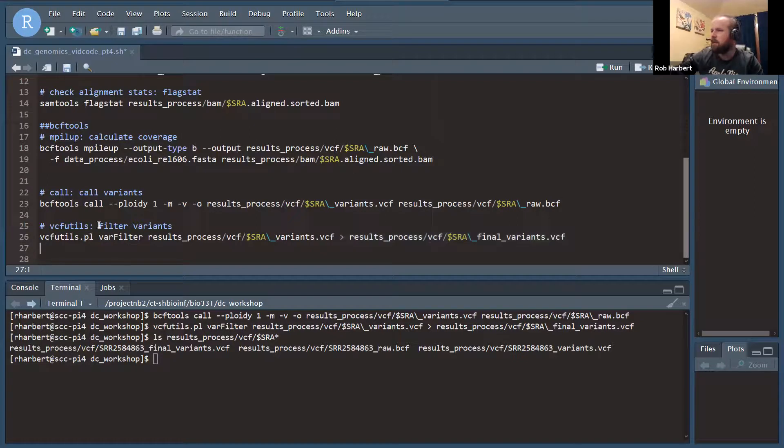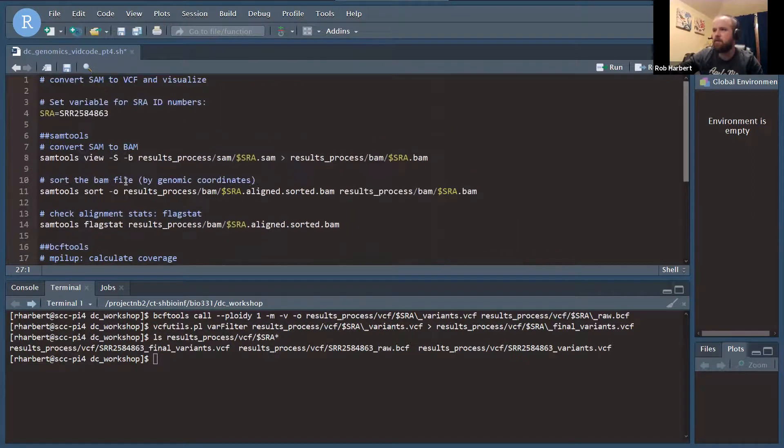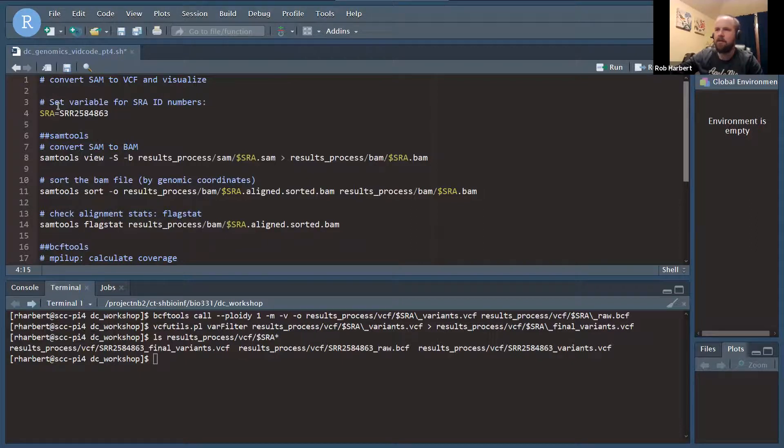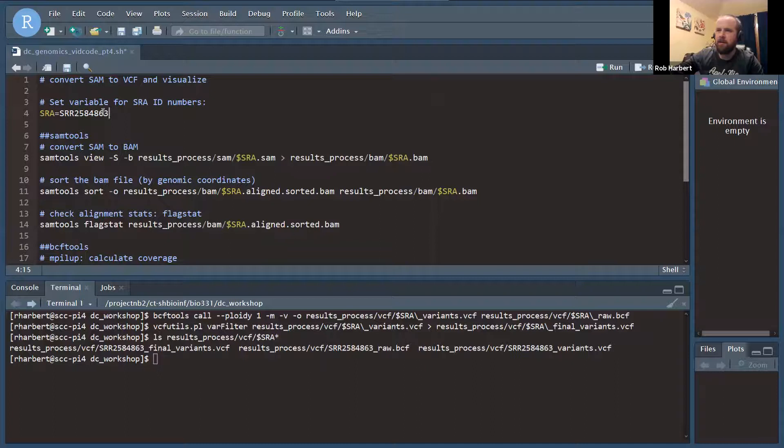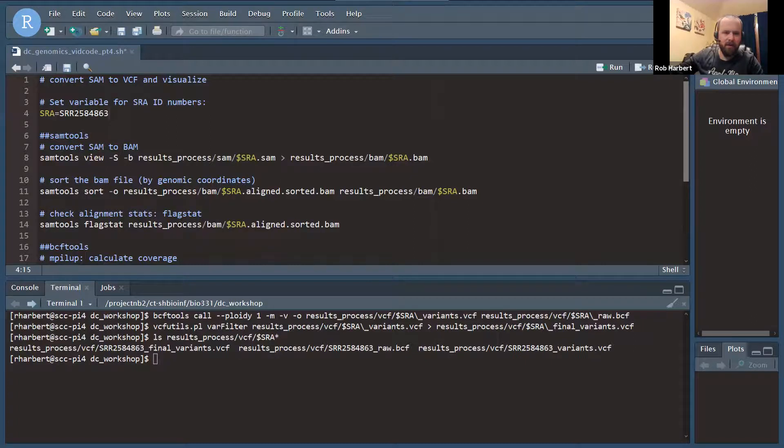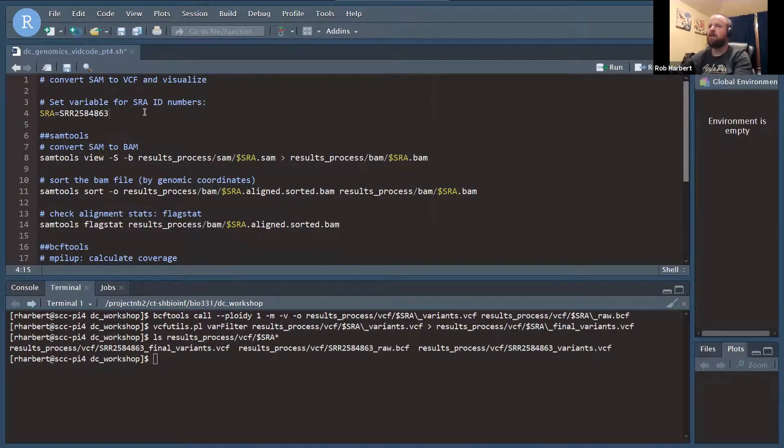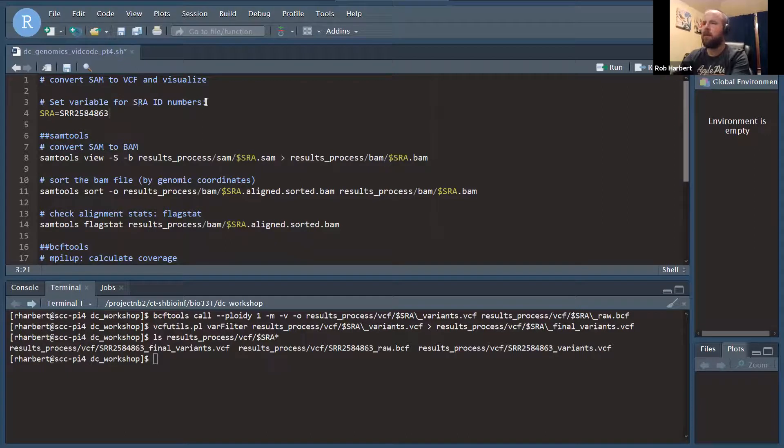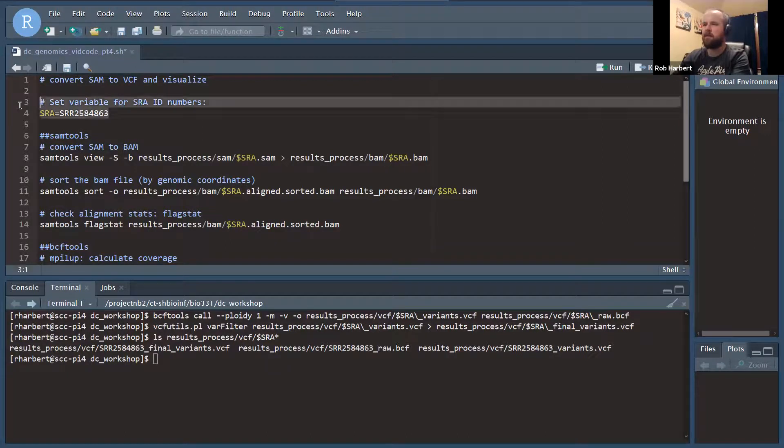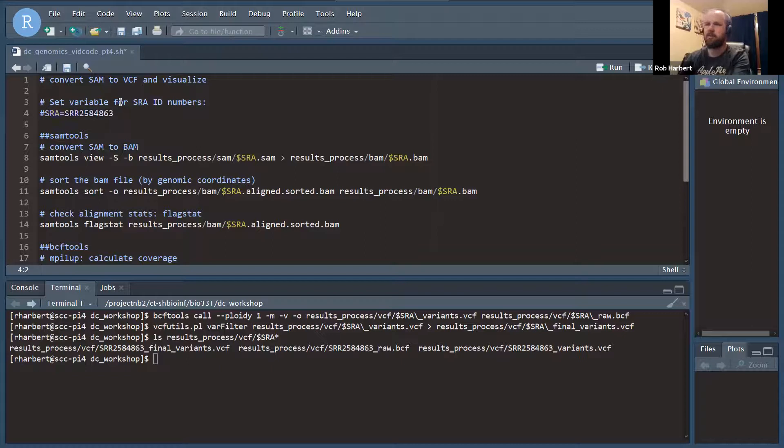This is a pretty good workflow here. It's more reproducible now, so we've got our SRA number defined in a variable up here. However, I think we can do one better real quick. I'm going to show you how to put this in a loop.